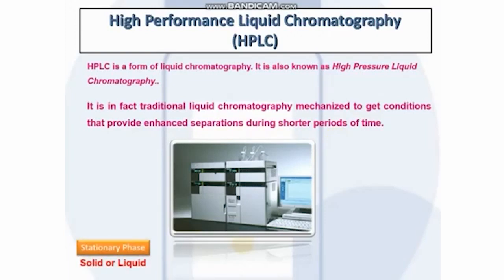In high performance liquid chromatography, HPLC, the stationary phase is a solid or a liquid, and the mobile phase is a liquid.